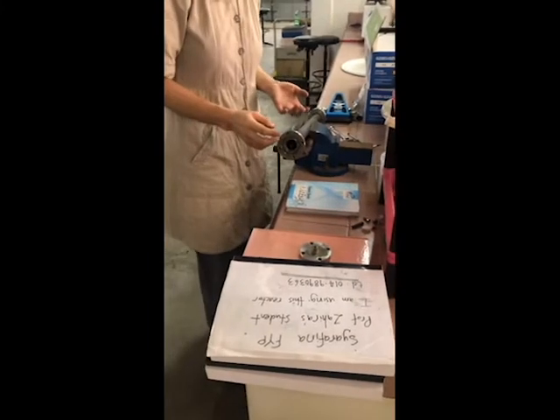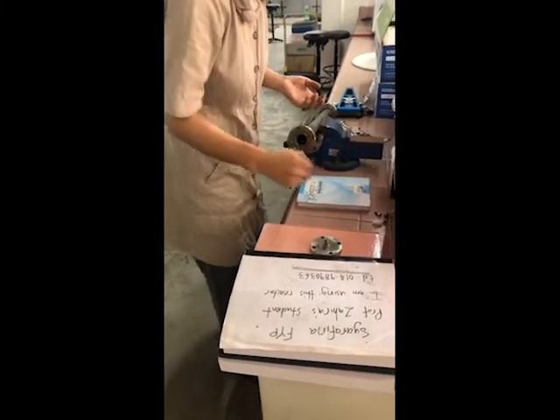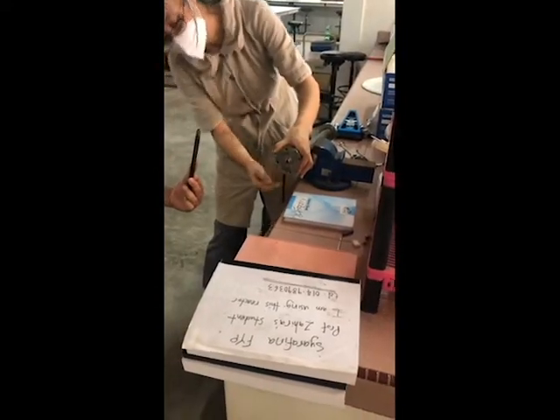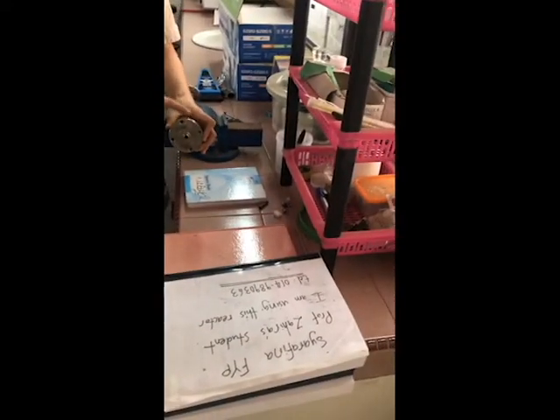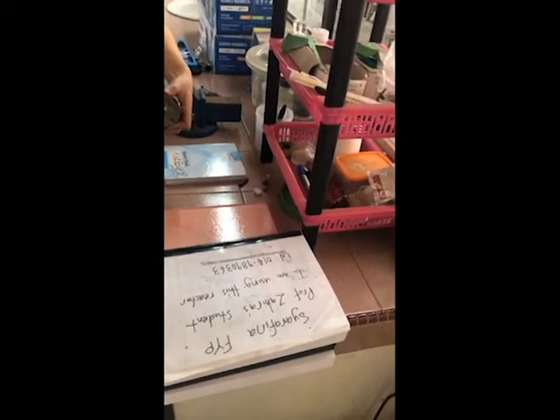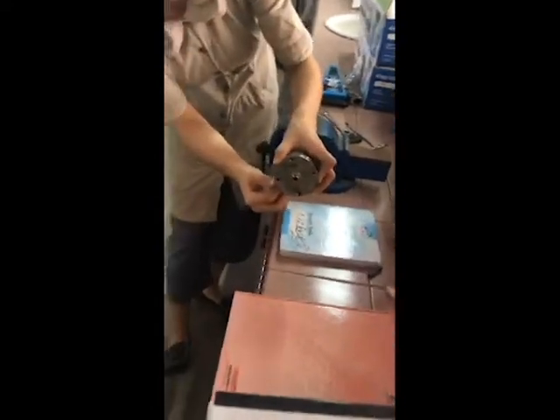After you finish installing your catalyst, you put this, then another two gas distributors. Then mark here. You don't need to search for which one is the screw. So you just follow the mark. For example, if you do this, you need to see where the hole is, right? So better to mark it. It's already marked here. So you use the available mark, then you can know the hole is just here.